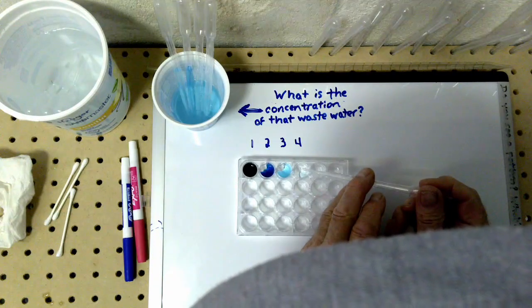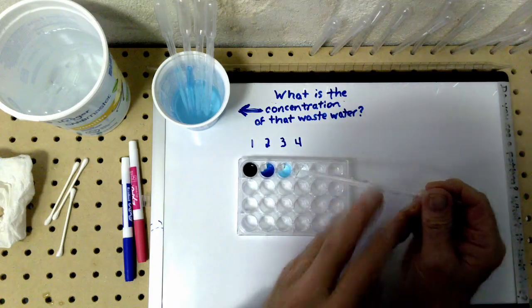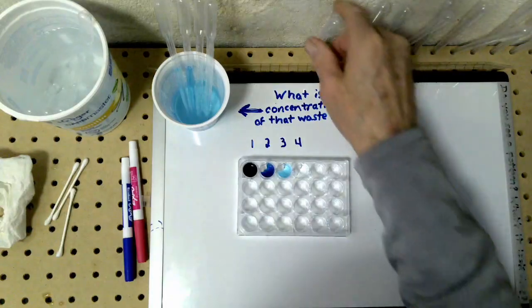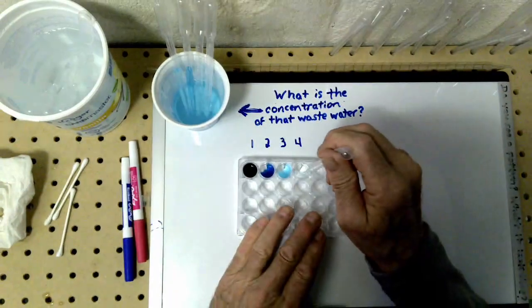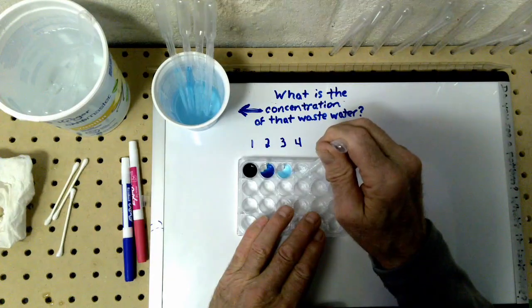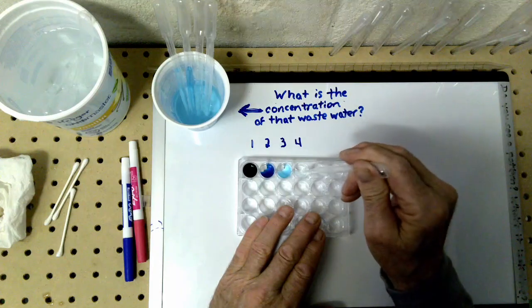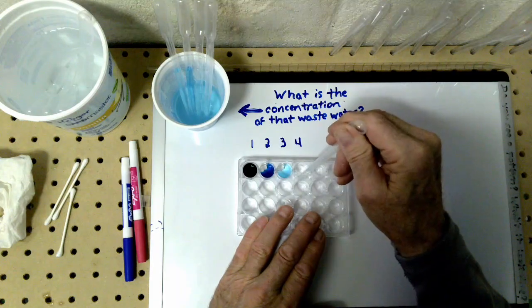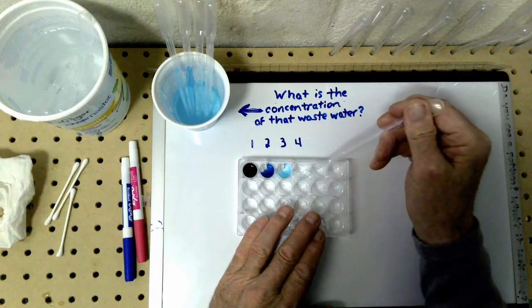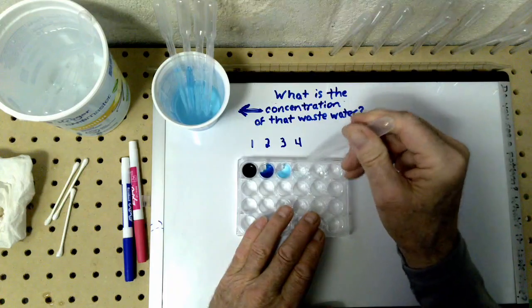1, 2, 3, 4, 5, 6, 7, 8, 9. There's that. Now, another pipette. So this is called a dilution series. We'll take one of those now. It's all stirred up and everything. 1 drop for a 10 to the 5th.